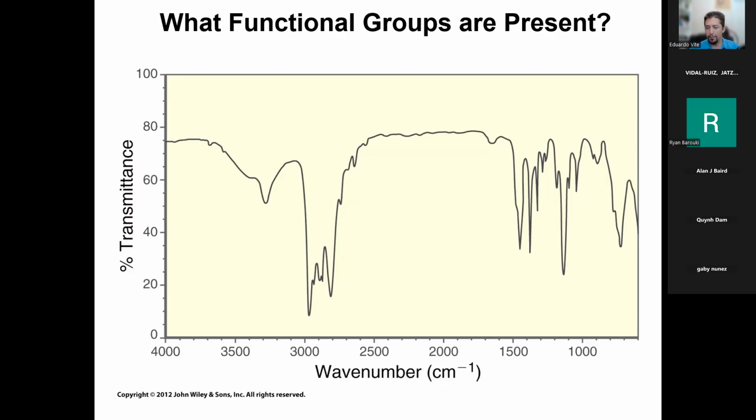Excellent. Yes, both of them correct. Yes, yes. A secondary amine at around 3,300, 3,400, right? Let's see. It looks like it's 33-ish, 3350. Let's just call it 3350 just for compromise. You see a weak, sharp signal. It's actually at around 50, so I would actually call that medium at this point.